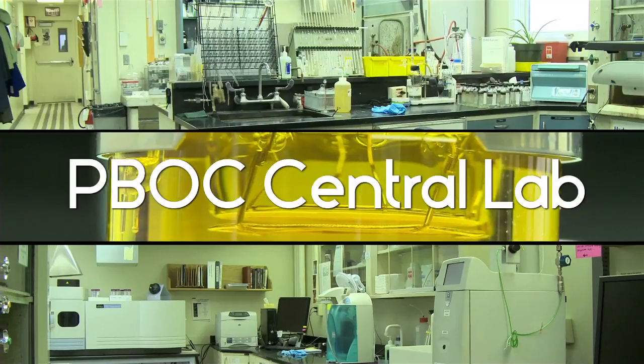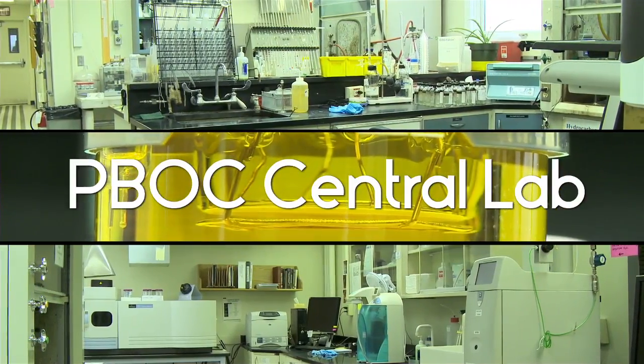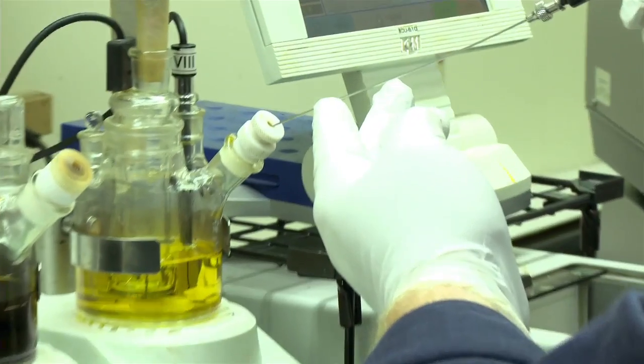We are at the PBOC Central Lab in Prudhoe Bay, Alaska this morning. We're going to walk you through the login process for our samples, oil and water and gas samples, and then later on we'll go through and explain each of the different areas and how the analyses are done.